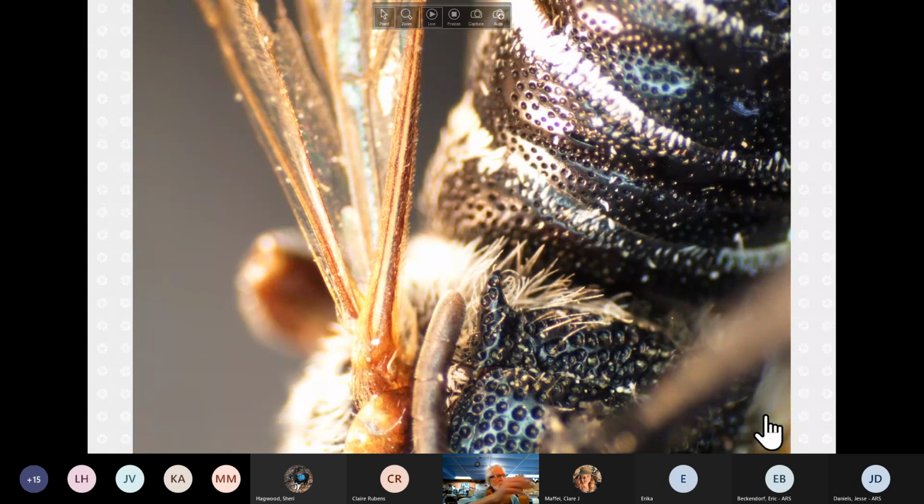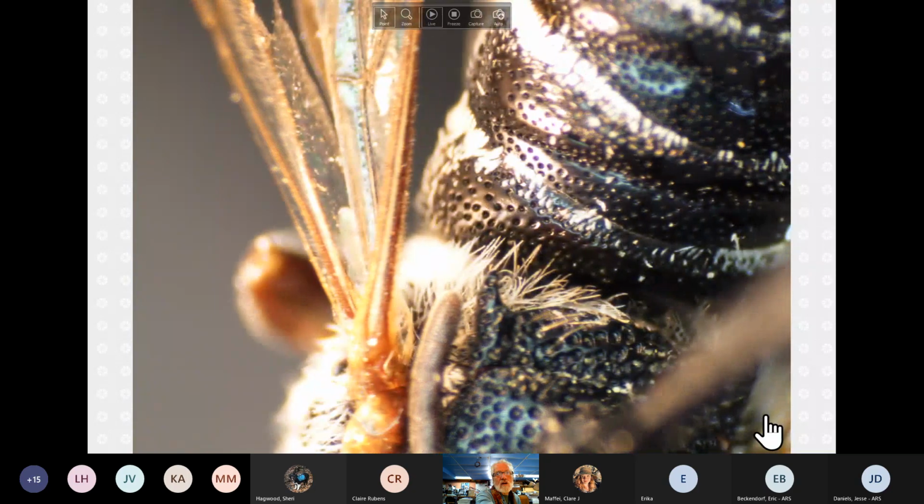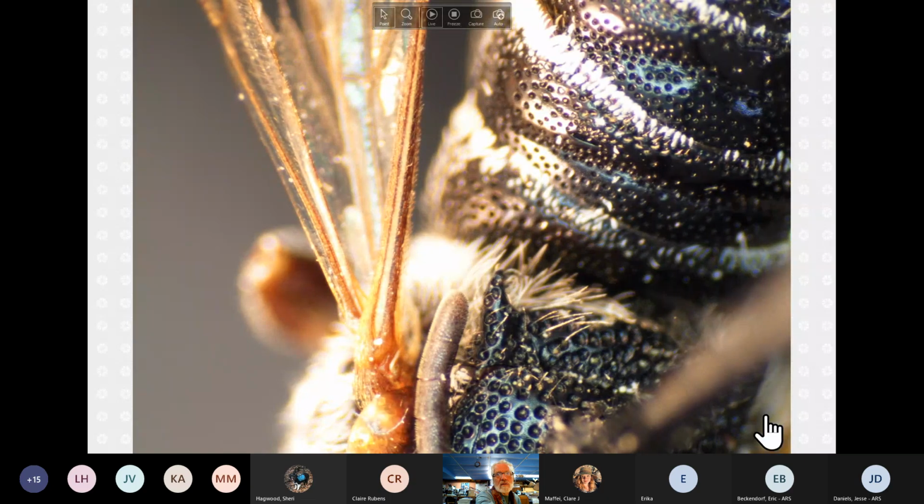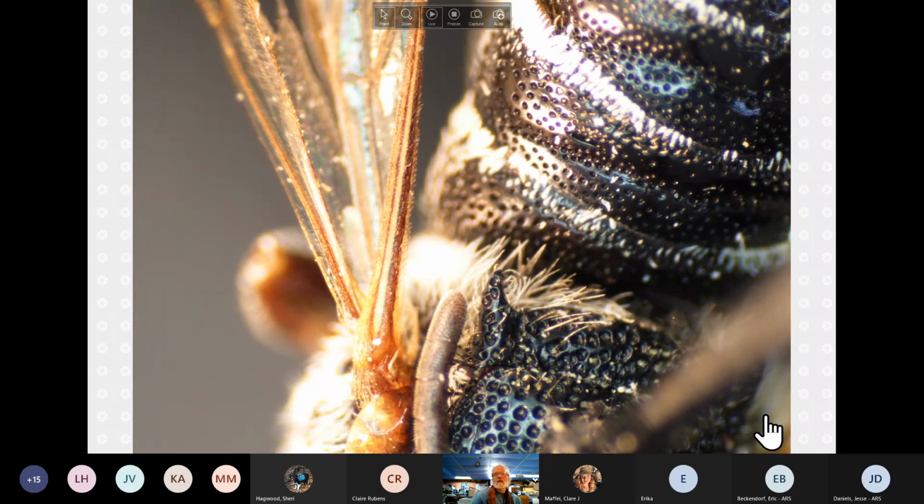And here is about as decent a shot as we're going to get of the fovea because it's a dark thing on a dark surface. I really don't like the fact that this is not letting me focus quickly. Interestingly, I can almost see some pits in there, I think. So maybe we'll have to modify that, pits not obviously visible, because it does look like if you actually peered into the depth, this is quite deep. There are some pits in this particular one. In any case, we will contrast that and you'll see that.